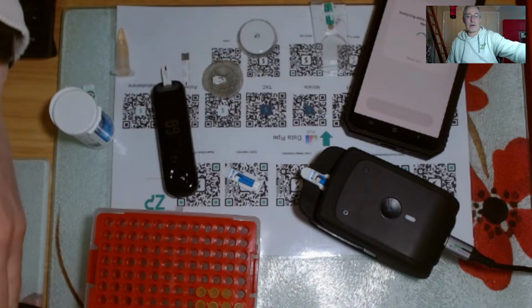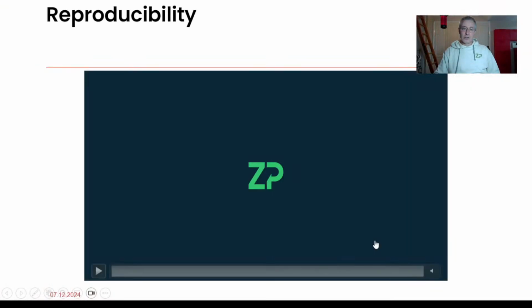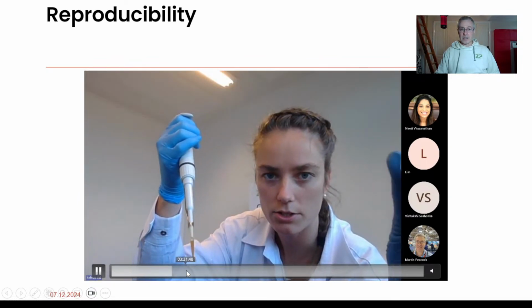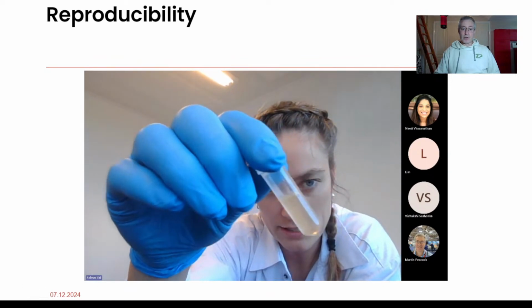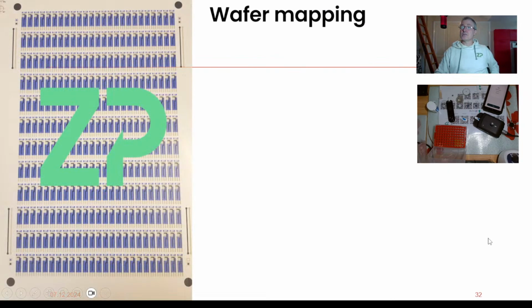That's not a parameter that I often talk about on this channel, and in fact I'll show you what I often talk about on this channel. On this channel we will often talk about, hey, here's a screen printed electrode, and hey, here's us doing it in a point of need measurement technology. So we do talk about screen printed electrodes, but what we're actually talking about is reliability, or repeatability, I should say.